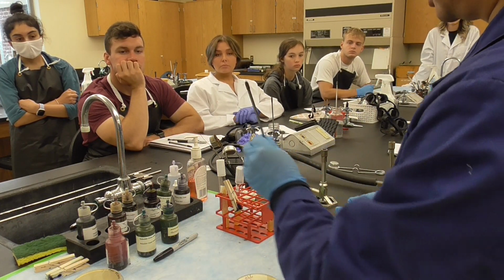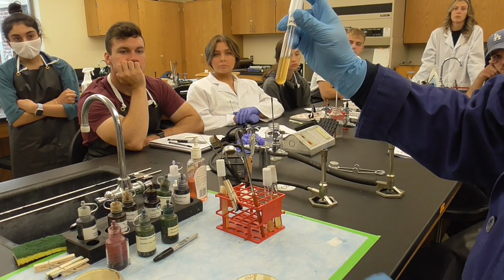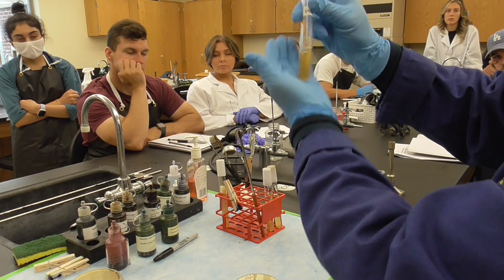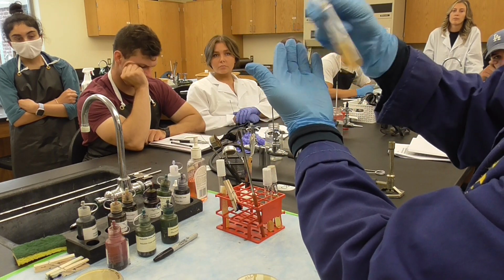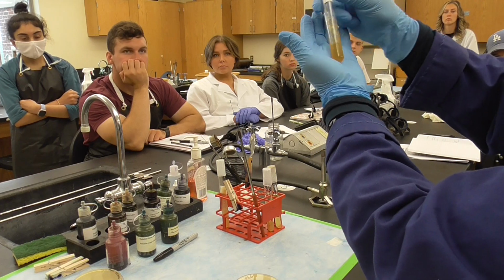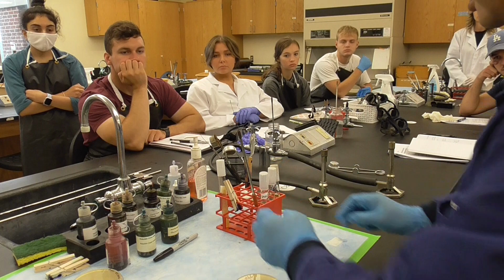Now we're going to do this unknown. How to do this unknown. Before we do this mixed culture, you need to shake it a little bit. Some of the labs have a vortex. You put it there, it will spin. We don't have that one, but you have to at least shake it. Because most of the bacteria are at the bottom. You see the whole turbidity, shake a little bit, like 10 times, and it's ready. Okay, how are we going to do?